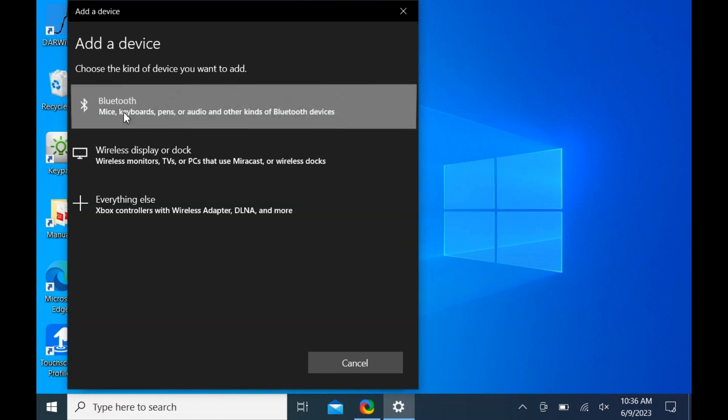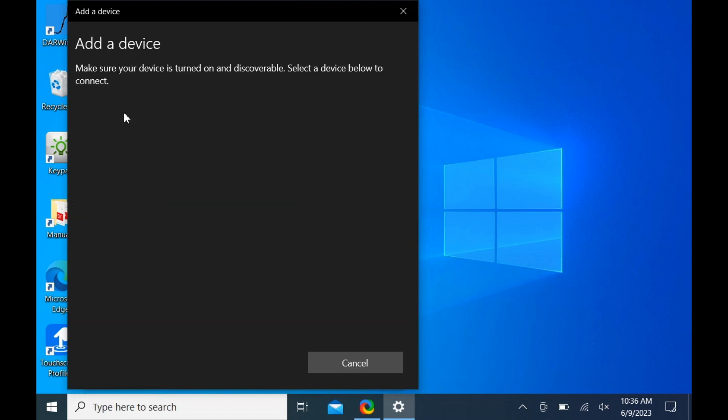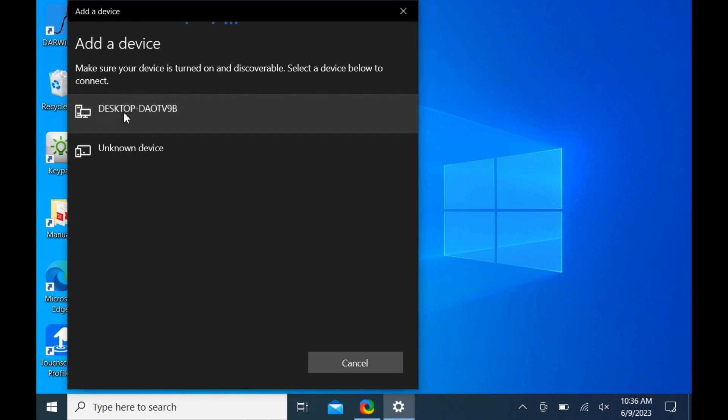Click Bluetooth. Then click the Spectral Evolution instrument you are trying to connect to.